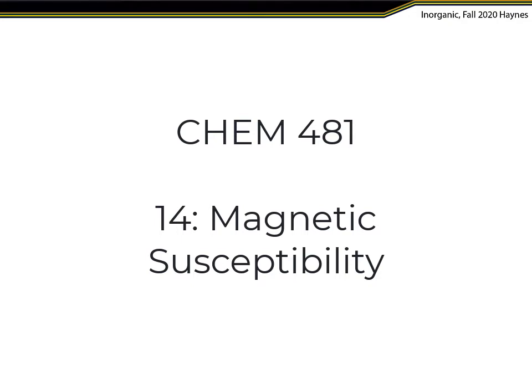All right. So our experiment for this week is the geometric isomers experiment. And as I alluded to earlier, the focus of this experiment is actually determining which isomer we make in the lab. So we are comparing two different compounds, right? The first one is a nickel chloride complex that has two triphenylphosphine ligands. And the other complex that we are making is the thiocyanate complex.